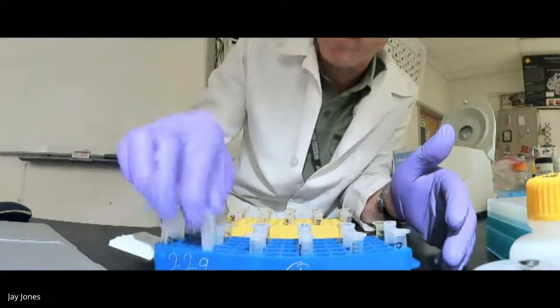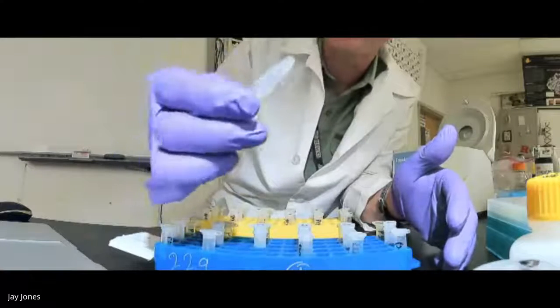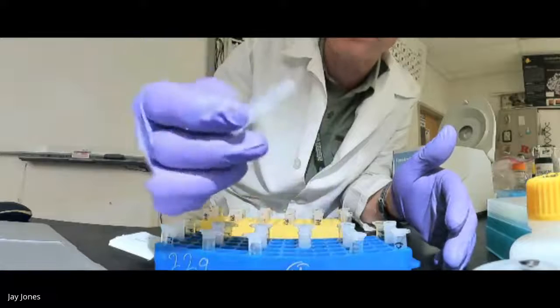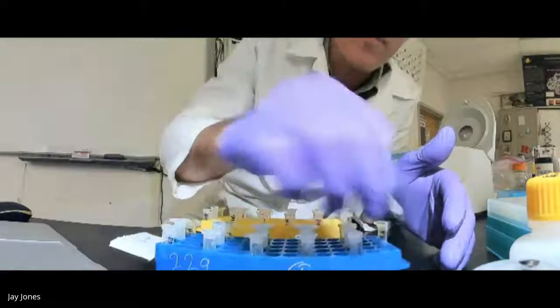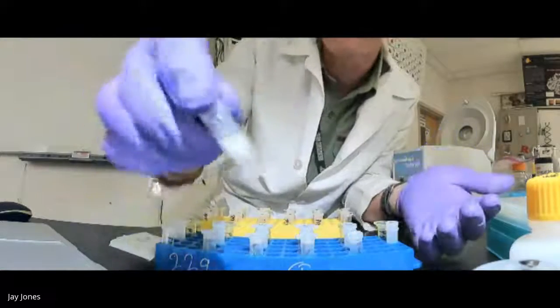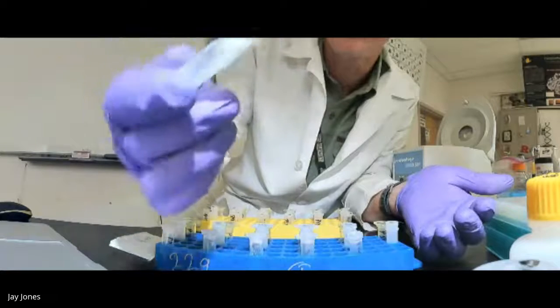That's what we want. I know it worked because the soap is not dissolving anything anymore. The soap is not dissolving, and instead, things are precipitating, like membranes, because membranes are really soaps. They have a polar end and a nonpolar end. Membranes are soaps.